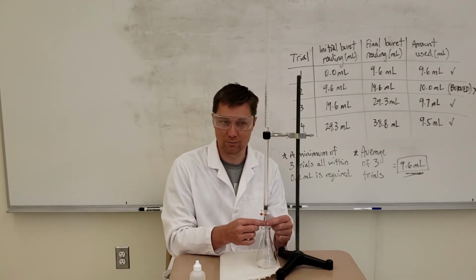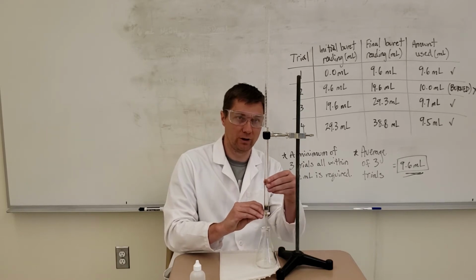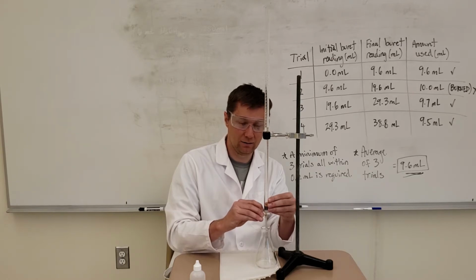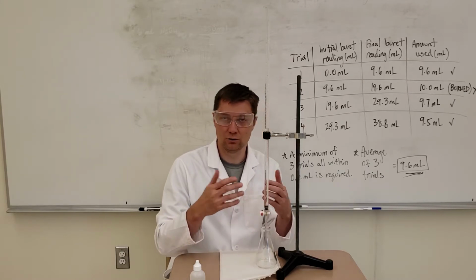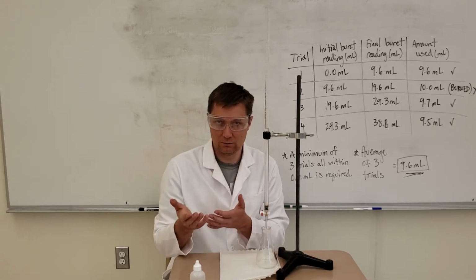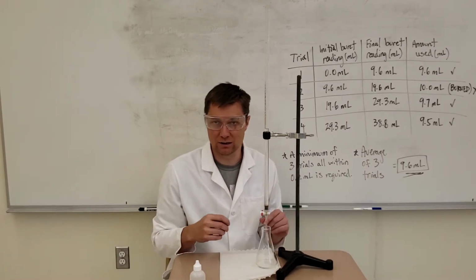If the tip of the burette is empty and you turn this open a little bit, the volume here in your measurement is going to go down, but you haven't actually added anything to the solution. So you just open this really ever so slowly, and the air bubbles start to come out. And if you go ahead and do your first trial like this, then you will have measured air being added to your reaction, and that's not what you want to do.